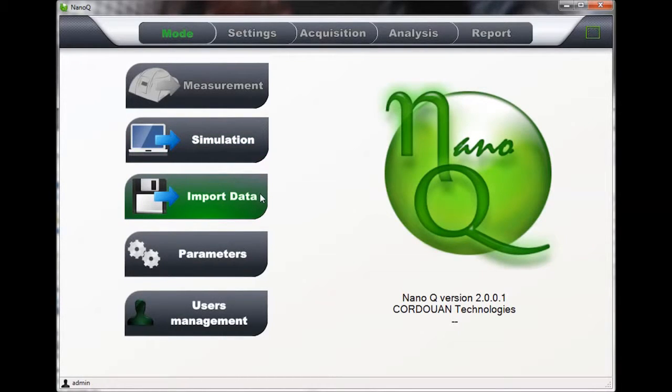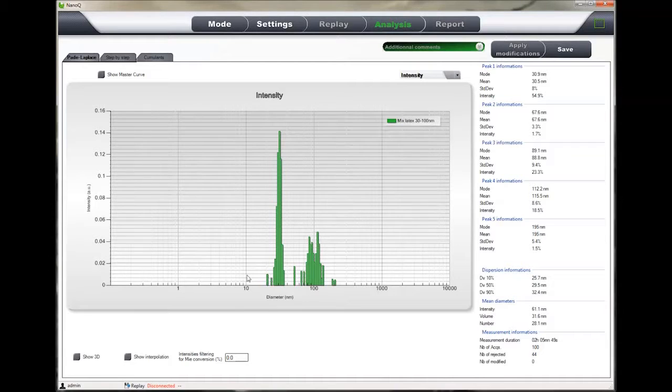The replay and import data mode which allows downloading, replaying, analyzing and filtering previously stored measurement results. NanoQ also includes advanced functionalities for an optimum use.